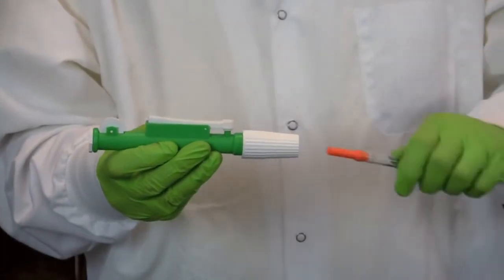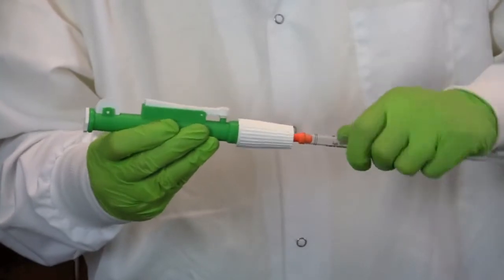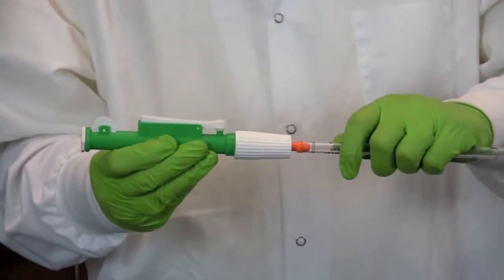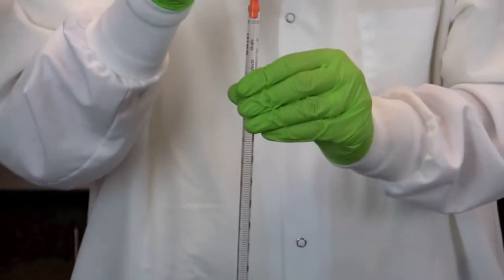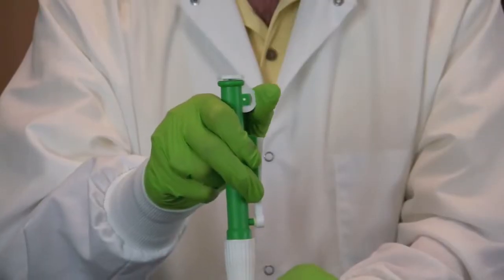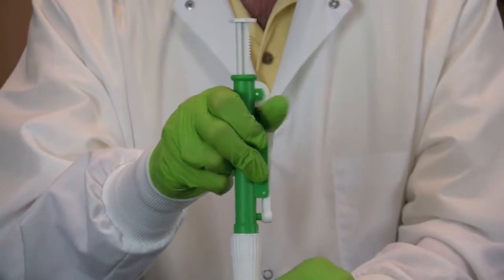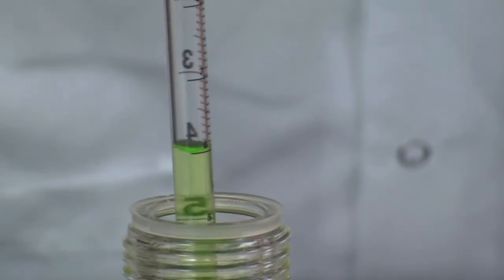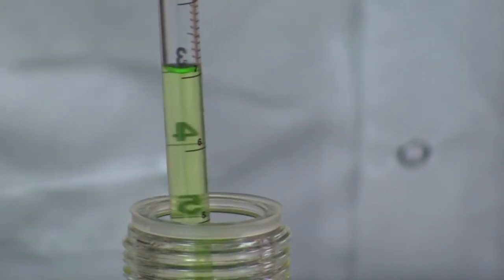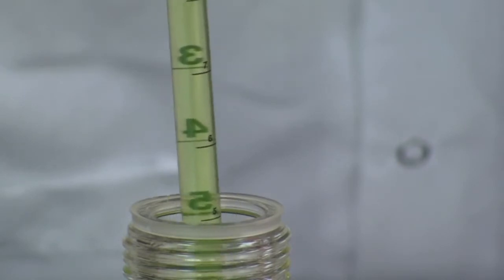Insert the pipette into the gasket by pressing and twisting firmly. Then insert the pipette into the solution to be transferred. Using your thumb, roll the dial downward to suck up solution. The dial can be moved up and down to get the exact amount of solution needed.